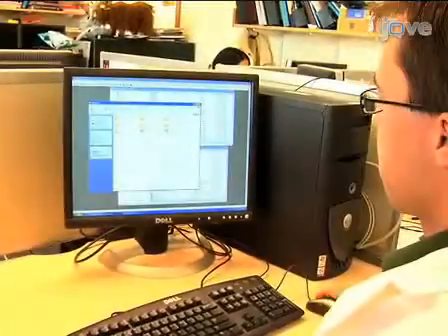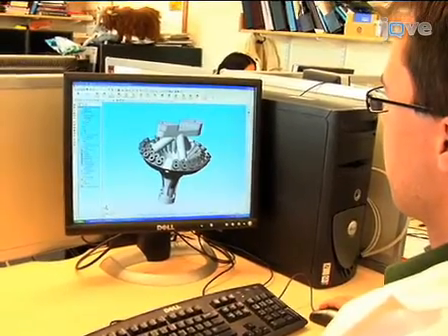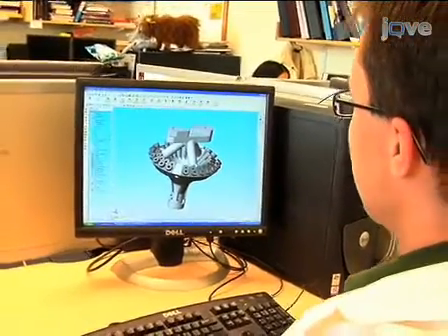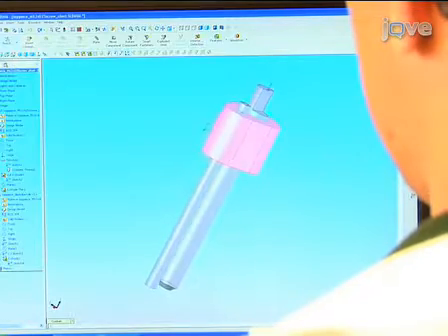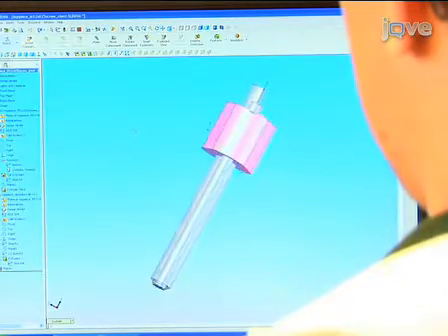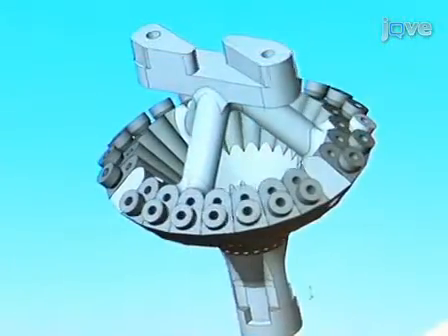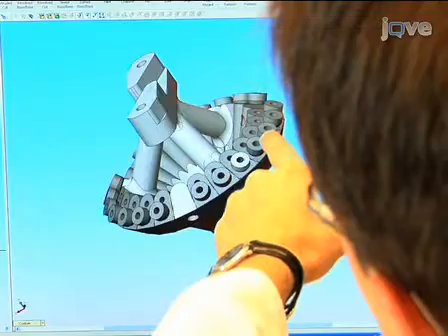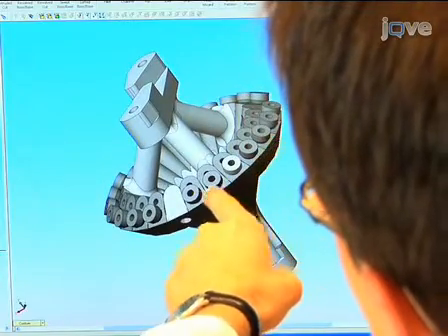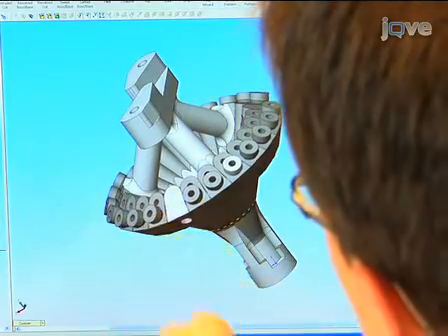The plastic base is designed using computer-aided design software and is manufactured using an inexpensive 3D printing process. We also model all the other components of the microdrive array. This allows us to carefully control the size and weight of the finished drive. At the top of the plastic base are two rings of holes that will accept the individual microdrives.